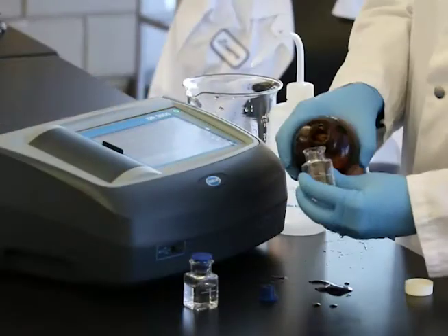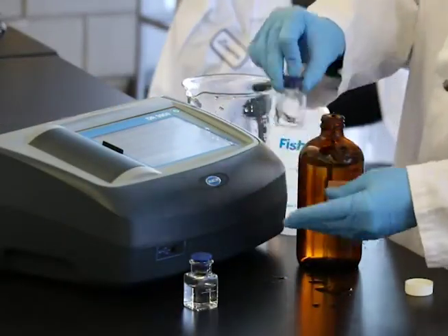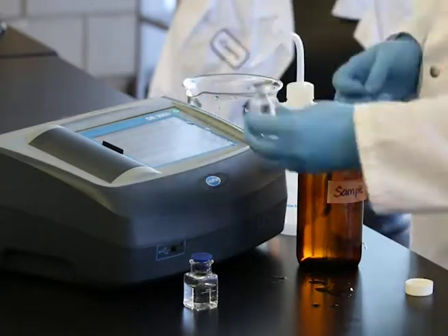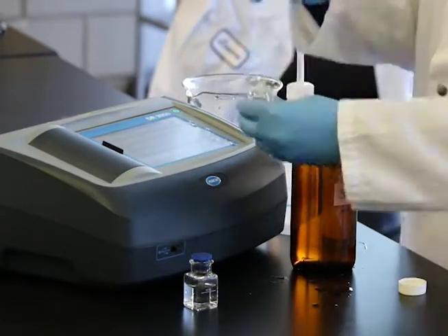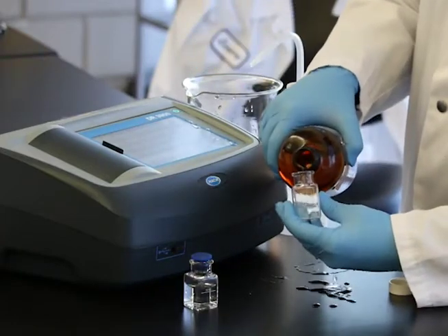Sample cells, adapters, and light shields will be indicated as appropriate by your instrument manufacturer. Prepare the blank and sample cell by filling them both with the sample water to the fill line.